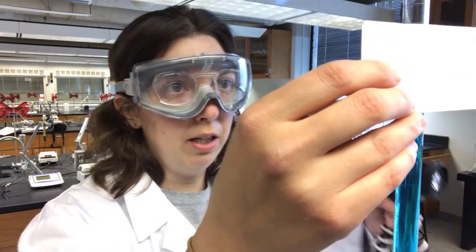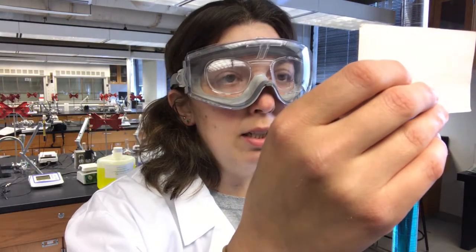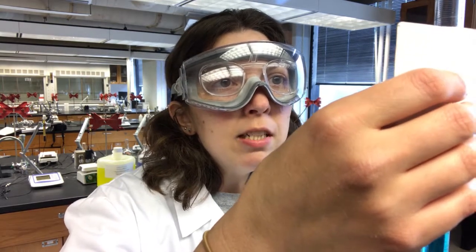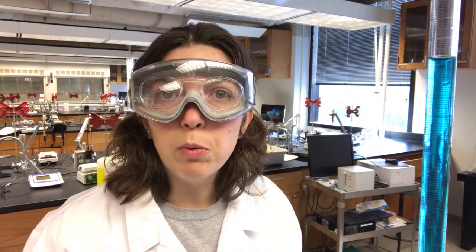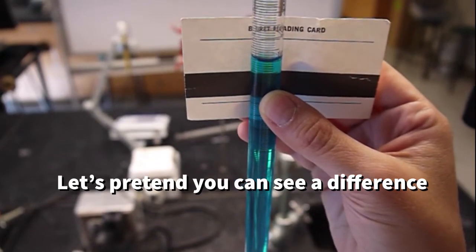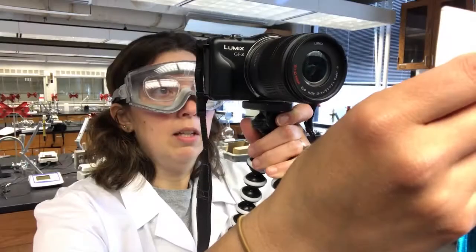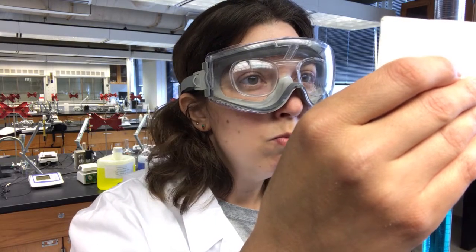Okay, so I am going to actually come up with a number here. So we are just under the 10 mil line, 10.1, 10.10, I would say. It is a little hard with this blue solution. So one of the things you're going to want to do is make sure your eyes are level with the meniscus. If you are looking, let's see if I can demonstrate this. If you're looking down, you're going to actually read a different value than if you're looking up and if you're looking straight on. Okay, that's the parallax error. Alright, so I'm going to get my measurement 10.11. It's just a little bit below that line, just a smidge.